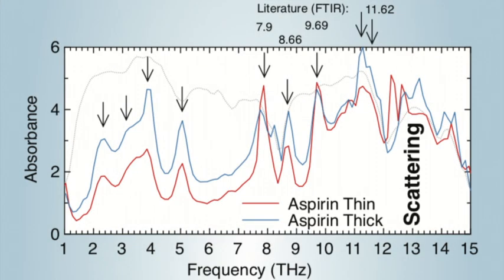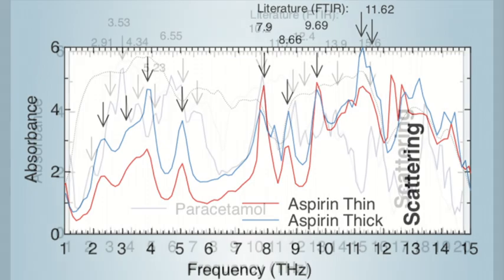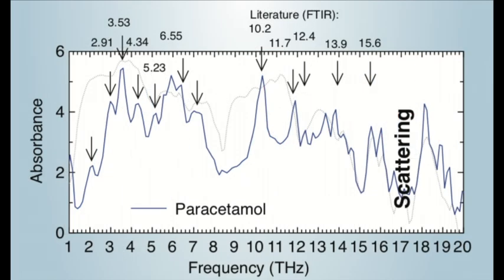And here we have the terahertz measurement of aspirin for a thin and a thick example. And finally, the results for paracetamol.